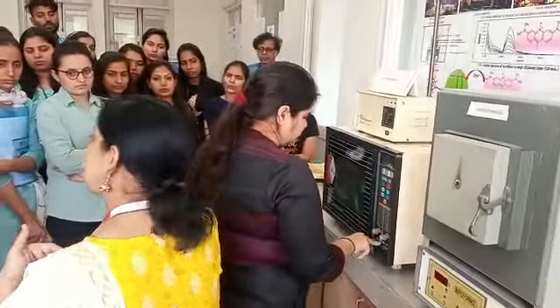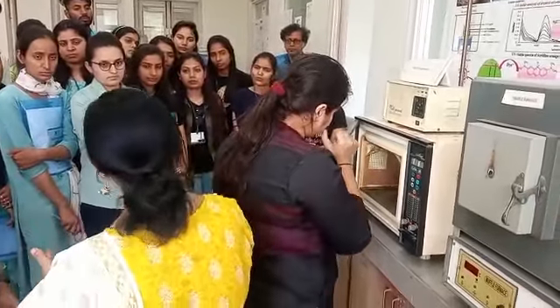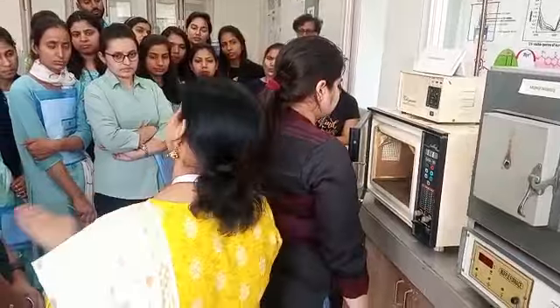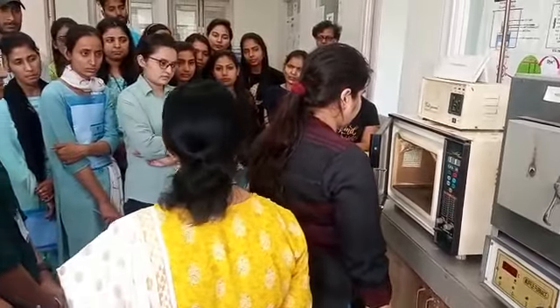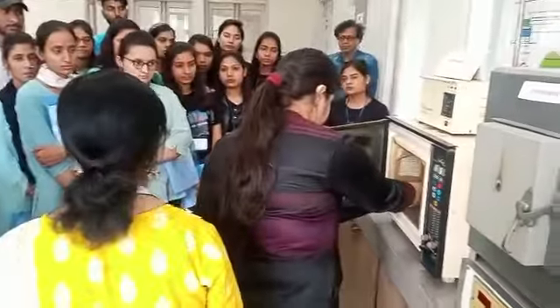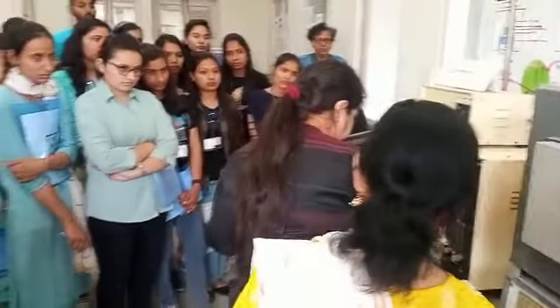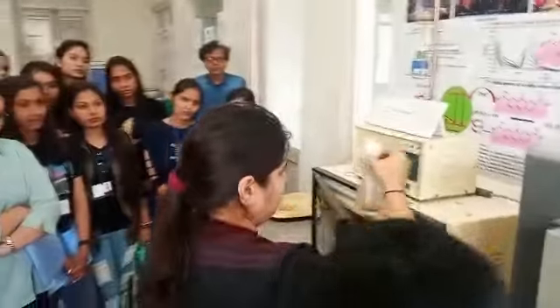If your product's RF value is different, and color and nature are also different from the reactant, it means your reaction is completed. Understood? That's why we are using thin layer chromatography for this purpose. Okay, now the reaction is completed. Completely you can see that your reaction is completed now, है ना?